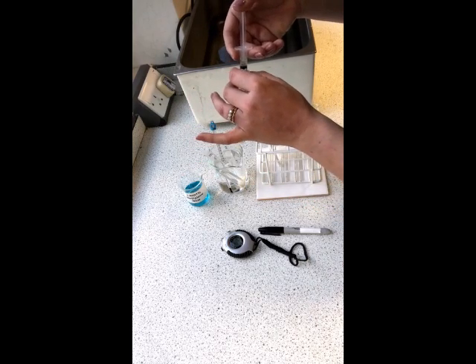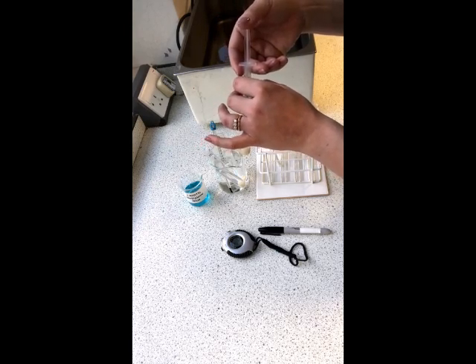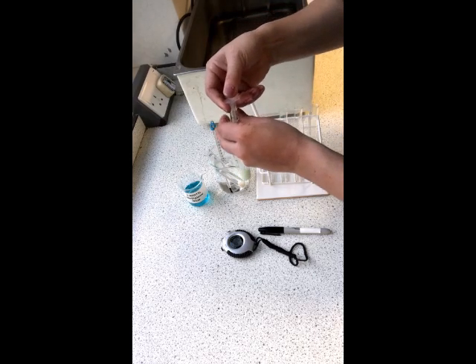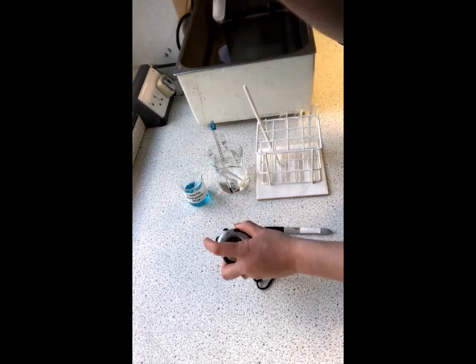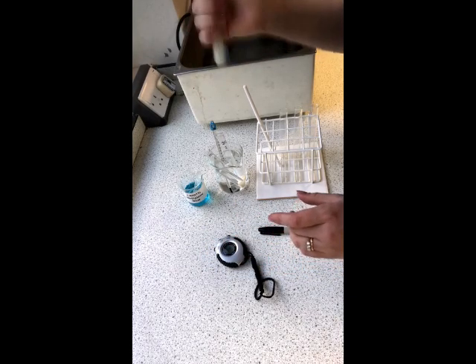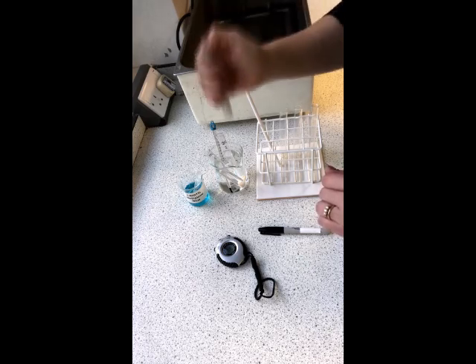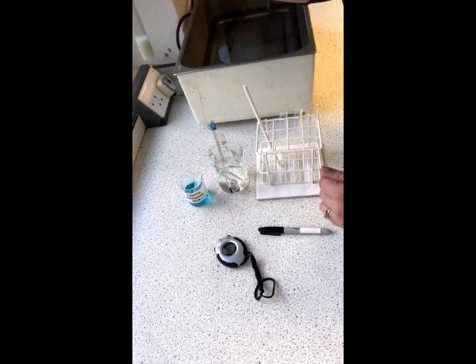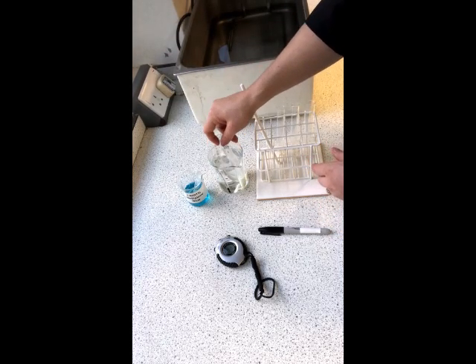So once we add it, we are going to shake it for around about 10 seconds just to make sure that it's thoroughly mixed, okay, and also start our timer. So mix it in, thumb over, start the timer. Okay, and then we are going to watch to see when we feel that the colour, the blue, has disappeared.